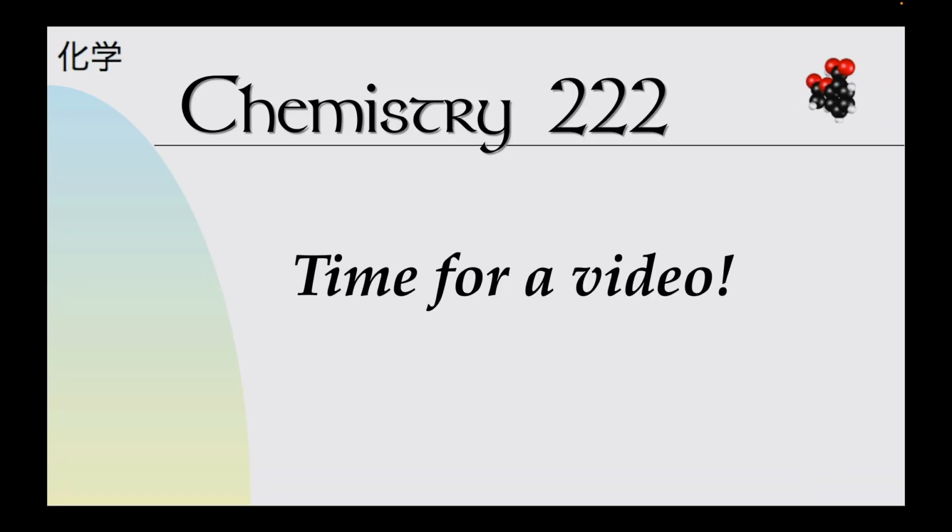Okay, at this point, let's watch a video to see how the molar mass of a volatile liquid lab actually goes. This is a fun lab, like I said, and you definitely want to make sure you wear safety goggles during the whole part, because we're going to have boiling water and gases, and it's going to smell. You don't want to eat or drink in the lab. It's nasty. You want to watch your electronics next to the chemicals, because they'll be splattering out and stuff like that. Just be careful in this lab, but it is kind of fun, and it's a powerful tool for chemists. Anytime you can find molar mass, it's pretty cool.